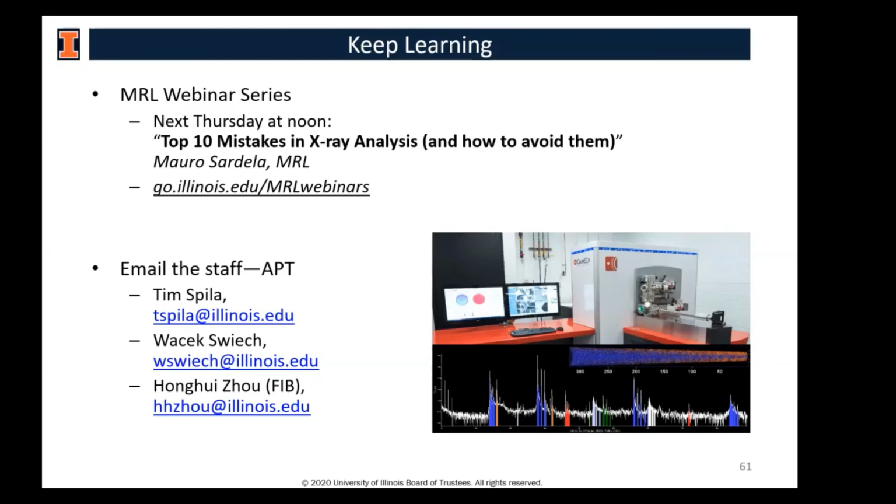All right, thank you, Tim. Thank you, Wojciech, for this outstanding presentation. We have a few questions here. The first one is about sample charging. Do you need to worry about grounding yourself when actually handling samples due to charge buildup, especially in dry winter air? Anybody want to take that? Wojciech, Tim?